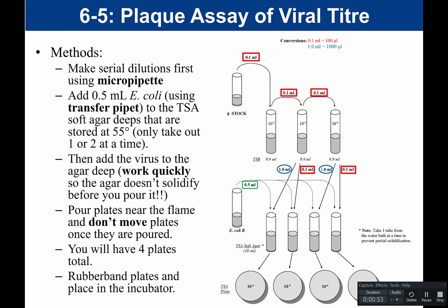In terms of the technique for the plaque assay, you don't need to memorize the entire technique. However, you should understand that when we're doing the plaque assay, we can't just plate the virus, right? Our virus is our phage stock, our T4 phage. So you should know that that's the name of our virus, a phage. And that when we go to plate our phage, we can't just plate it on agar alone, because remember that viruses are obligate intracellular parasites. They can only replicate within a host cell.